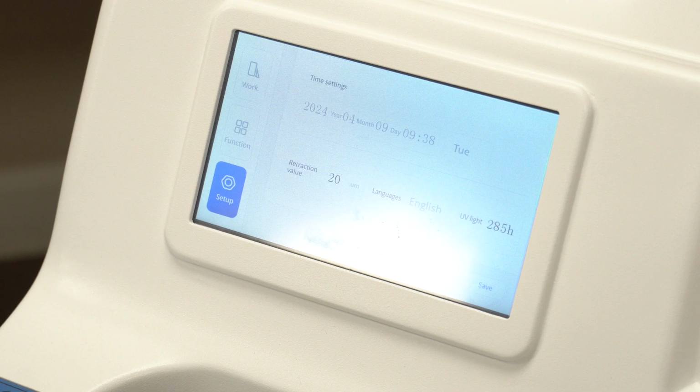This prevents tissue damage or contamination between sections. A value of 20 microns ensures precise sectioning while minimizing specimen risk. Adjusting this parameter is crucial for consistent, damage-free tissue sectioning.